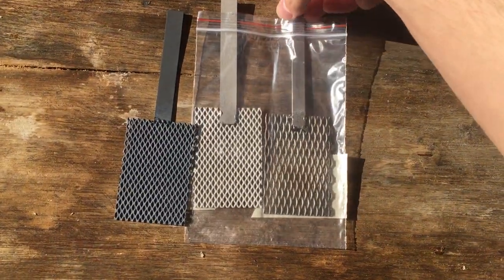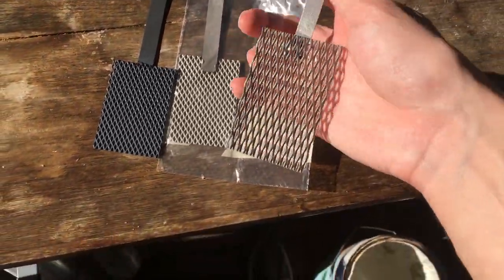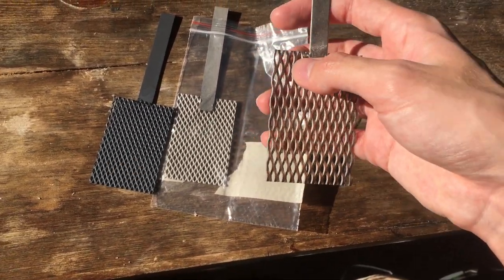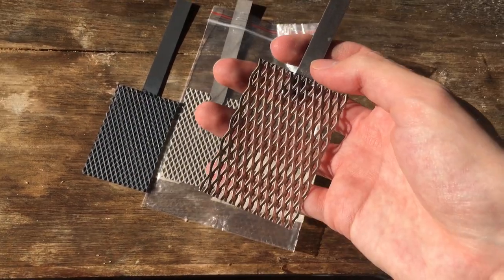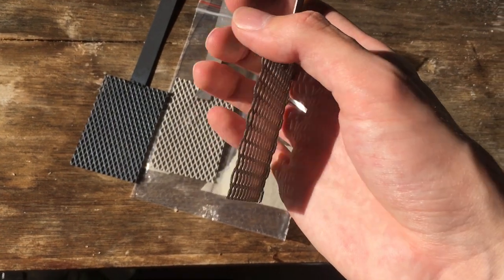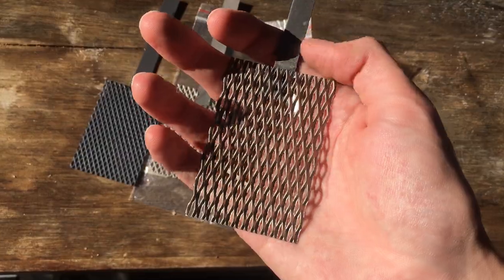Next up we have a titanium cathode. This is basically just the perfect cathode you can have for most electrochemical experiments, being very inert — or at least very resistant to chemical attack. And what it does is it normally limits side reactions in a lot of electrochemical processes.